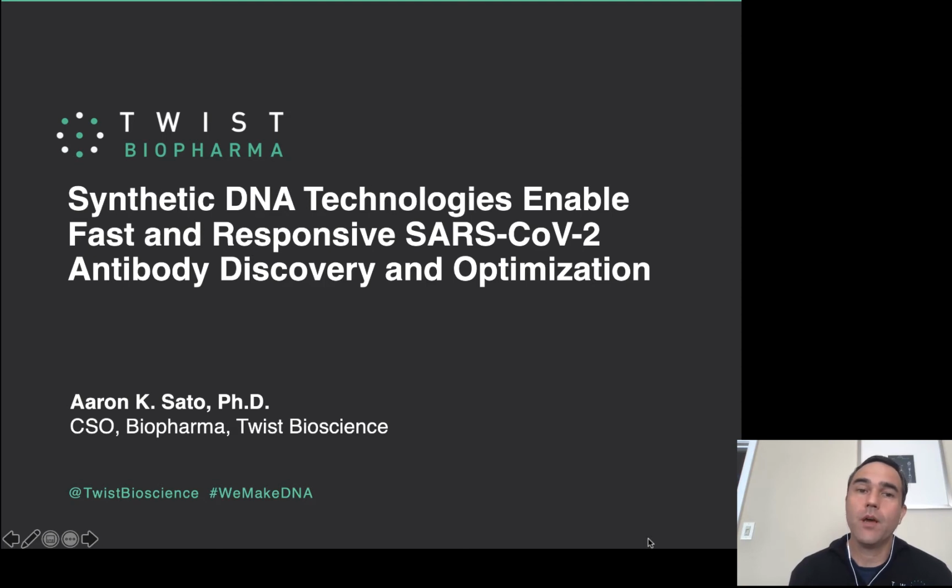And today I'm going to tell you about how we utilized our antibody phage display libraries within the team to actually discover antibodies to both the SARS-CoV-2 S1 protein as well as ACE2.